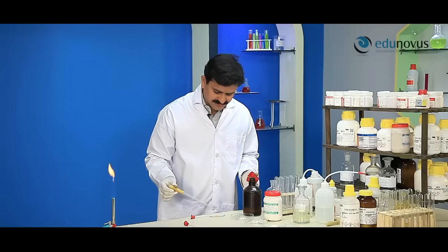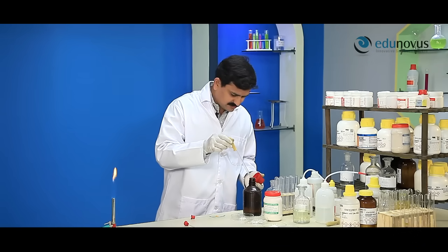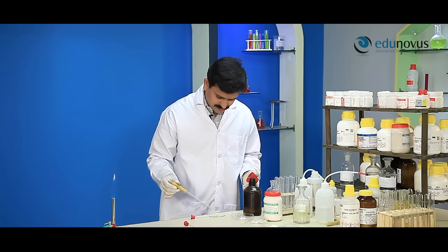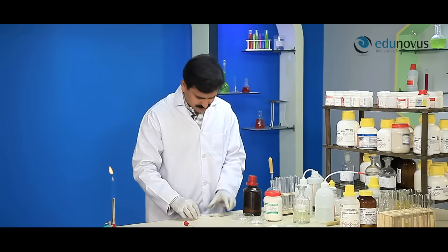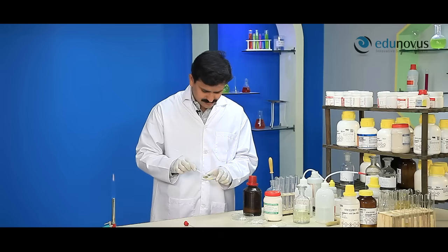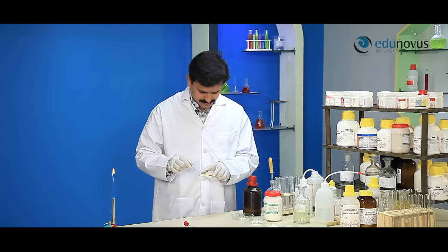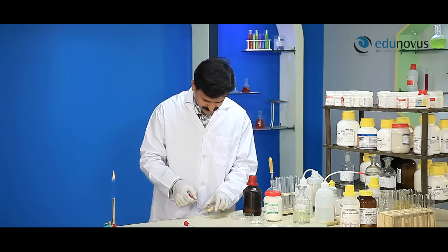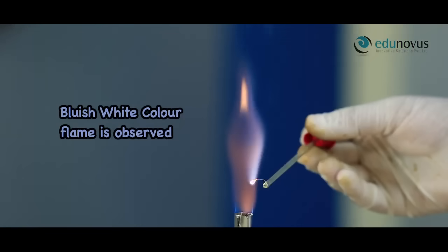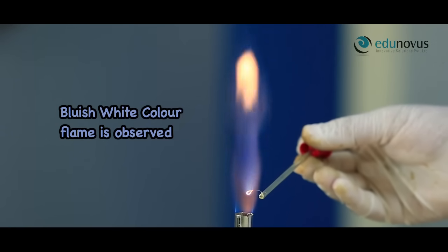Here we need to convert the given salt into paste. This appearance of bluish white color in the flame indicates the presence of lead radical in the given salt.